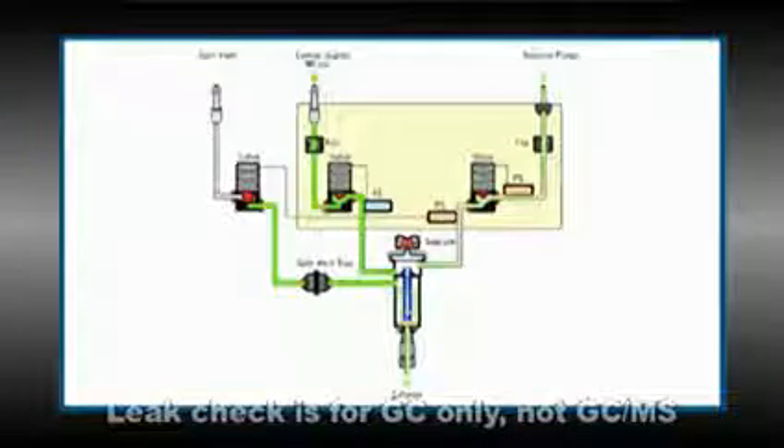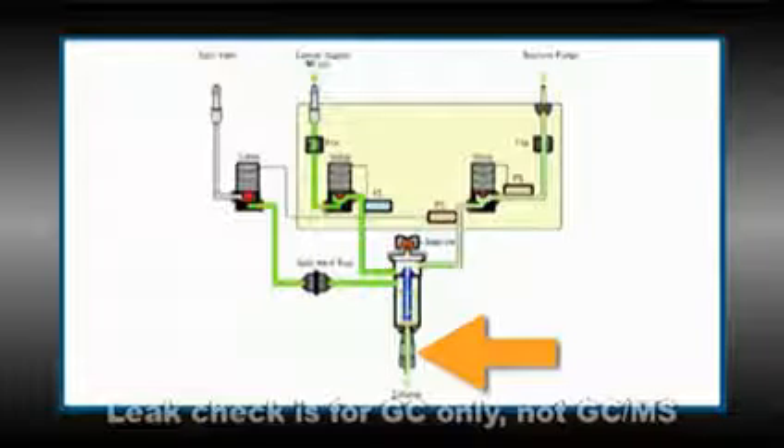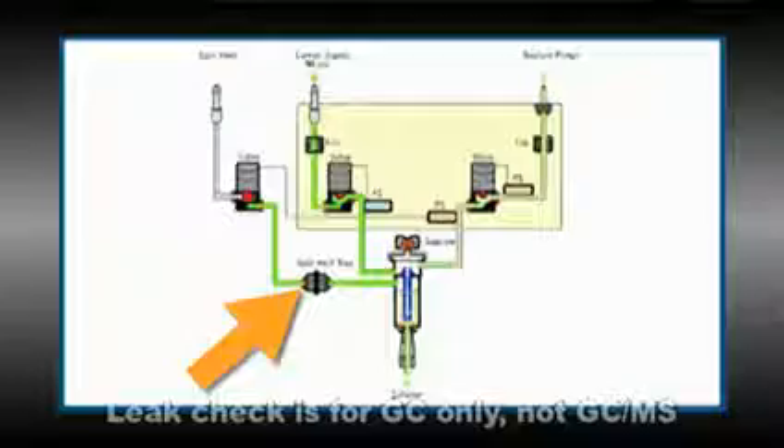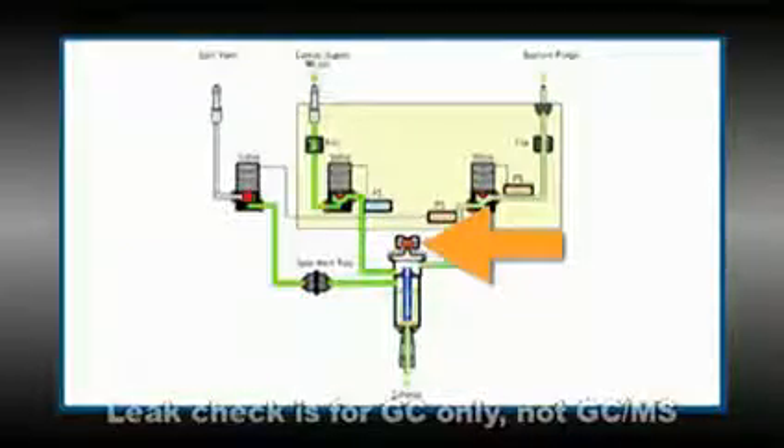Here's a sketch of the leaks it should help you find. It finds leaks at the inlet column fitting, the gold seal, the split vent trap housing and the vent line, the septum and the septum nut.